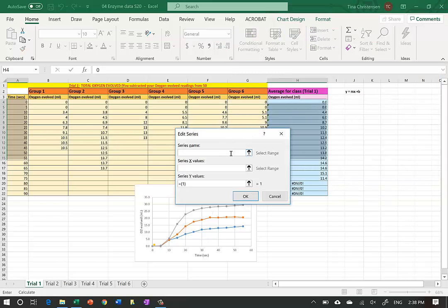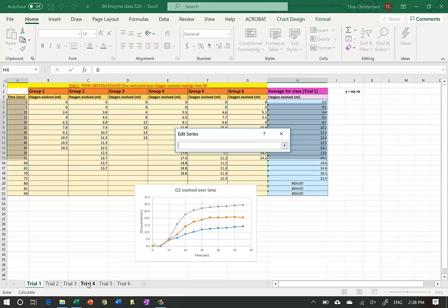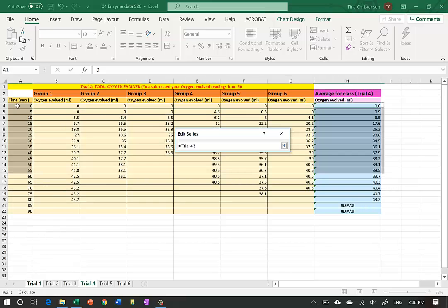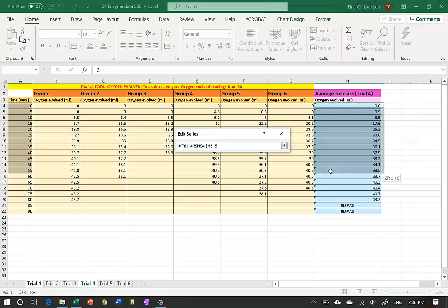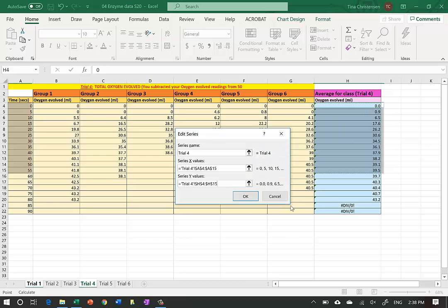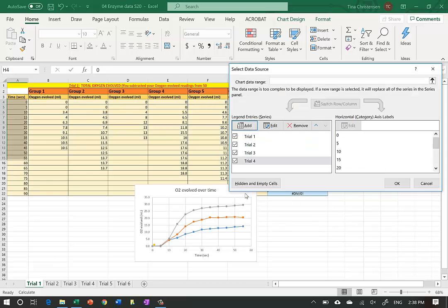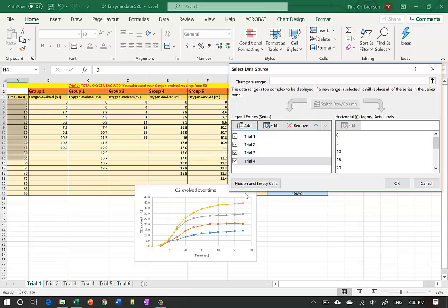I'll keep doing this for Trial 4. I select X values by clicking the arrow, go to Trial 4, highlight from zero to 55 (down to row 15), then select the Y data on the Trial 4 tab, highlight the last right column down to row 15, double-check it, and hit OK.